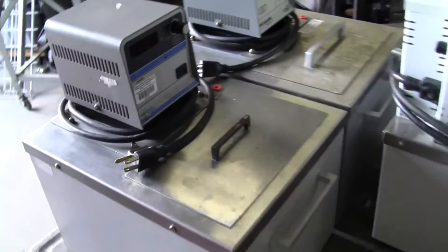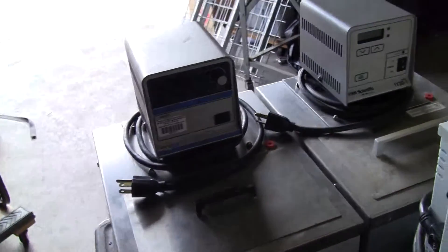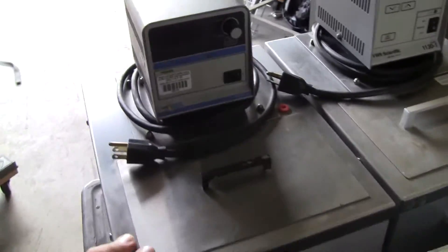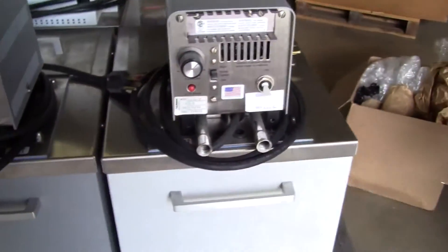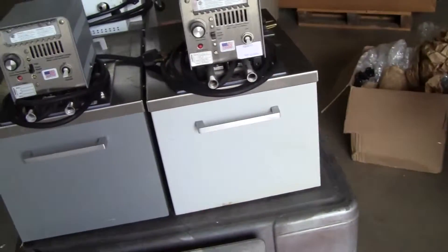We have your two VWR units. That's 1130-1. This is the PolyScience — model number here is 1130-2. Back in the units, these work fine.